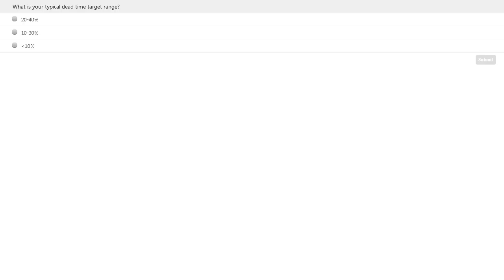So now I'll turn it over to another poll and ask you, as a typical microanalyst, what is your typical dead time target range? And again, please remember to click on the Submit button at the lower right-hand side.